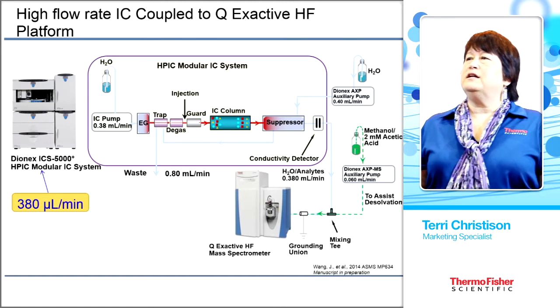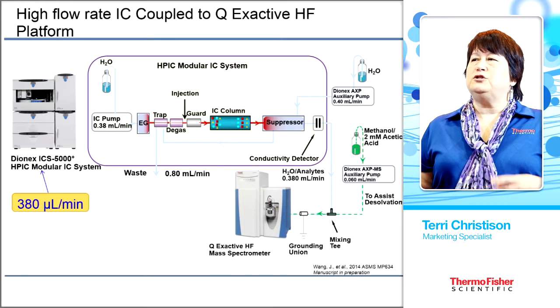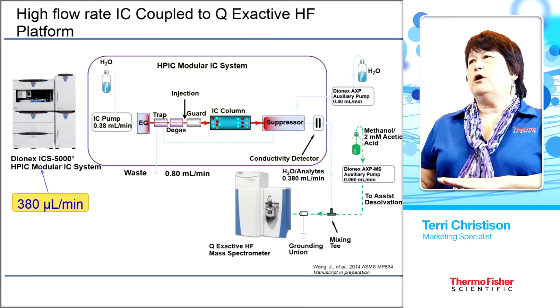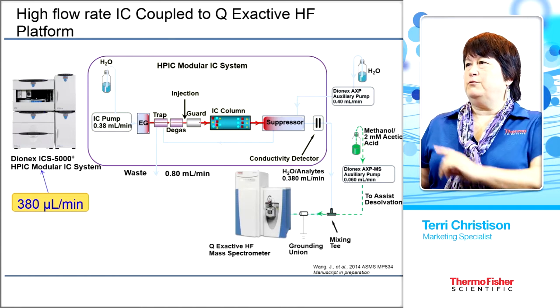Now, these electrolytic devices require a backflow of fluid to drive the chemistry of the electrolytic devices. Since we're using the effluent to go to the mass spec, we now introduce water to drive those reactions up here in the right-hand corner.